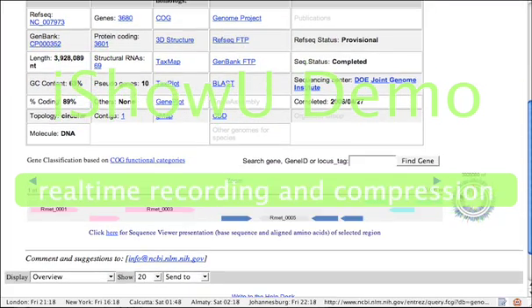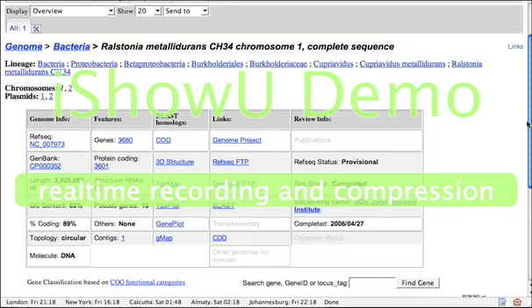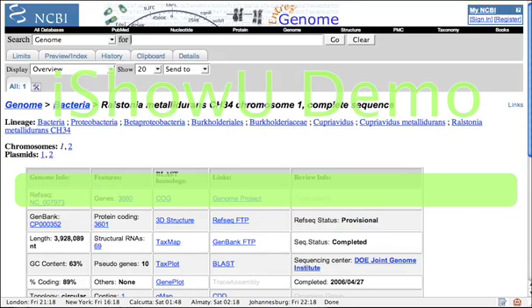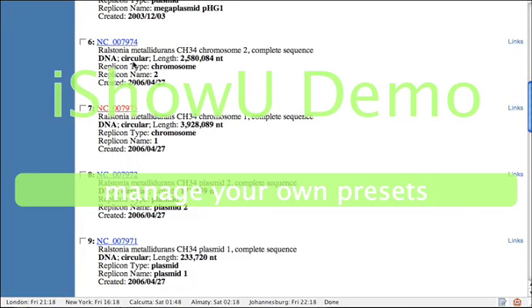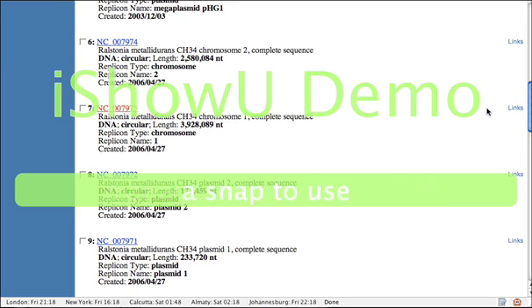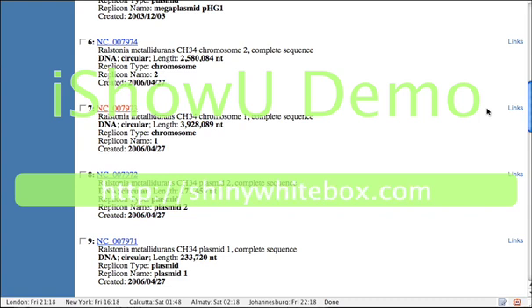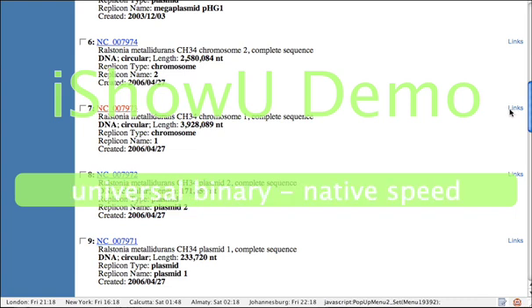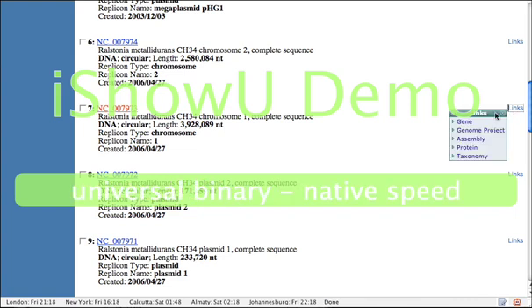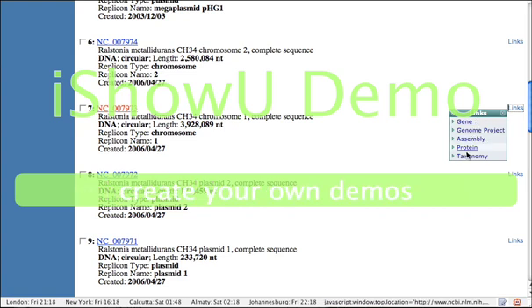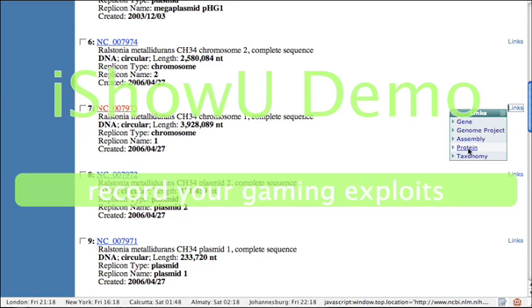Here is a genome map for the genome. But we will actually go one step back, only because there is less information on this page. Here is an important feature of the NCBI site which is often overlooked, partly because it's in one corner. The Links tab here opens up a pop-out with a whole bunch of sub-links, and today we are interested in cloning proteins from the genome, so we click on Protein.